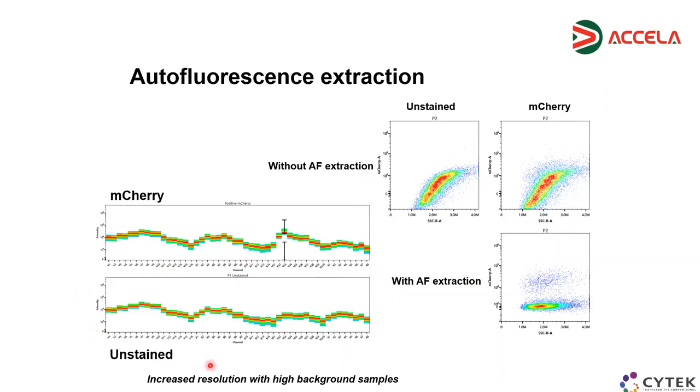Yeah, so the user has to evaluate, of course, in which situation the background can apply some quite relevant error into the analysis, because it's not always necessary to subtract the autofluorescence, but it's a very nice tool that conventional cytometry is not offering.